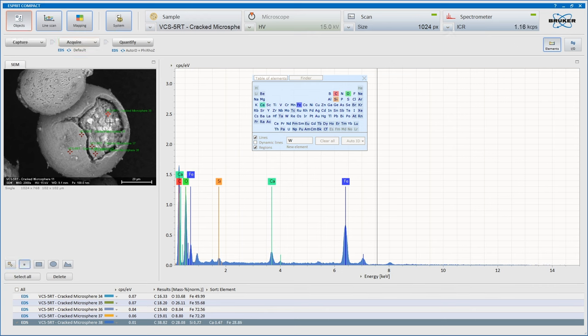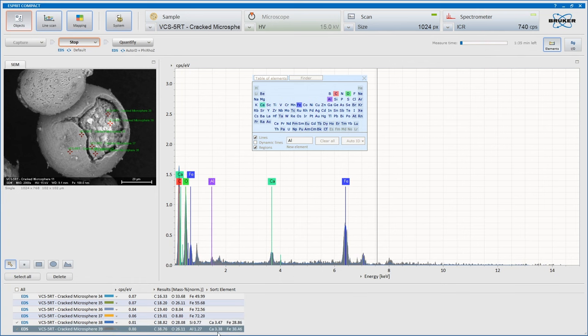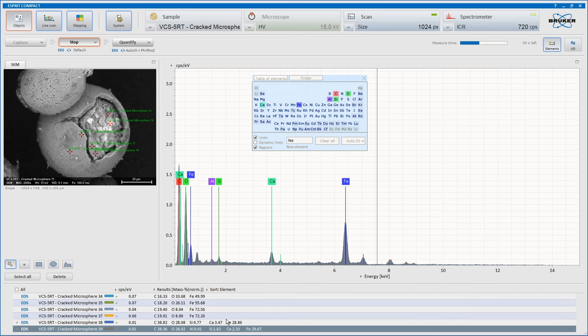So we'll try this area. It seems to be charged, which means it might get some more electrons. Yeah, we've got double the electrons here, but the story is similar, except we're seeing aluminium here instead of silicon being detected, although I would suggest that silicon is being detected. There we go. Definitely seeing calcium.